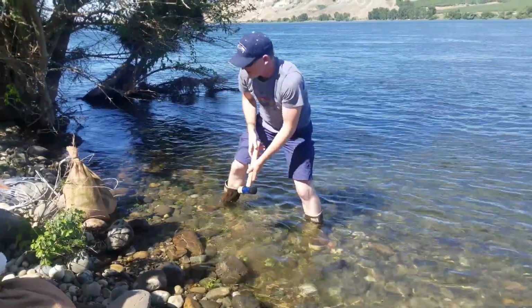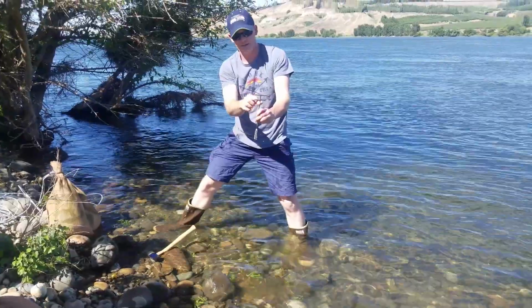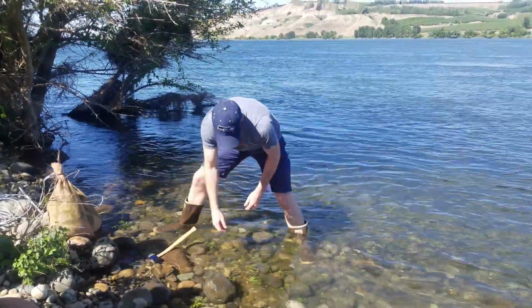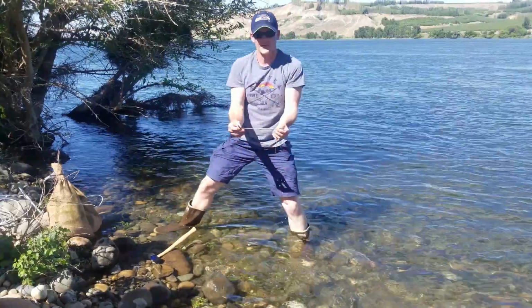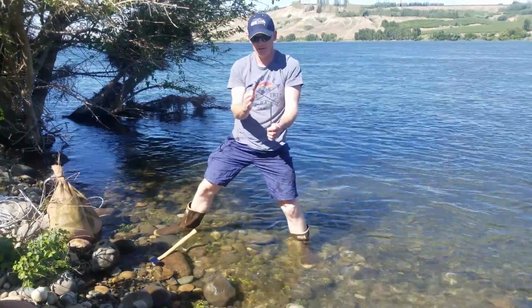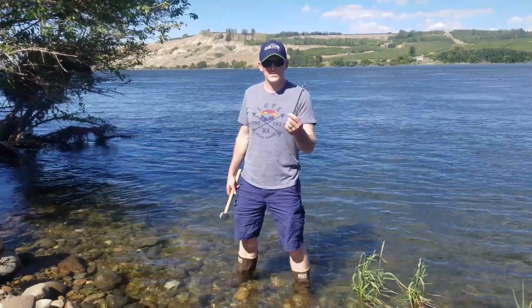All right, so that's installed. You want to install it so that the handle here is touching the riverbed, so it's all the way in. At this point, you can pull out the support rod. It's critical that the support rod is inside when you install the push point, otherwise the end will bend and break. You also receive 2 other push points, so 3 in total.